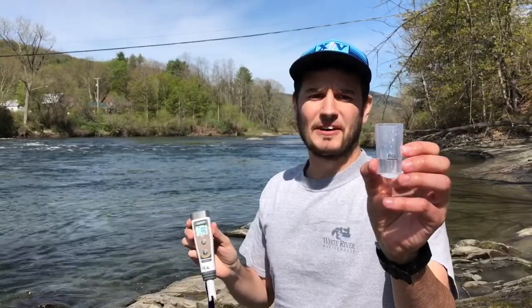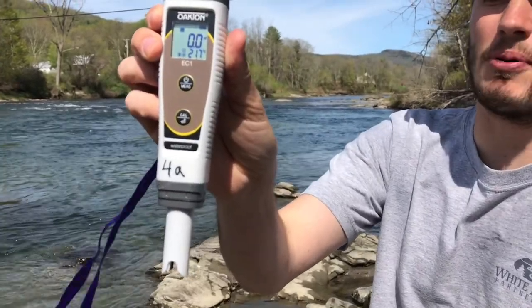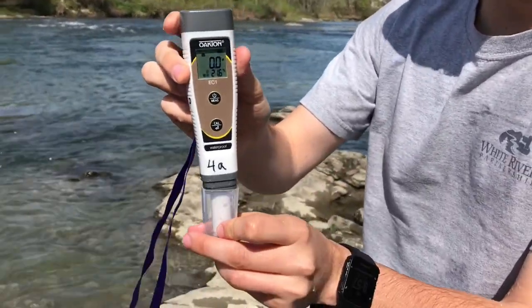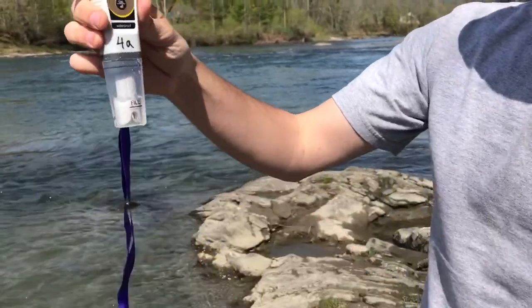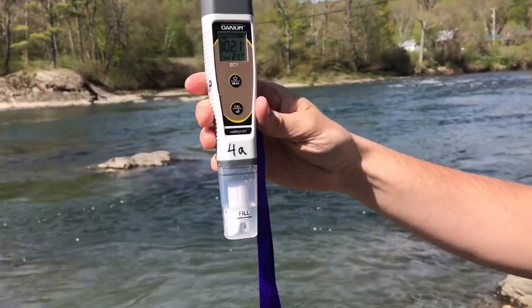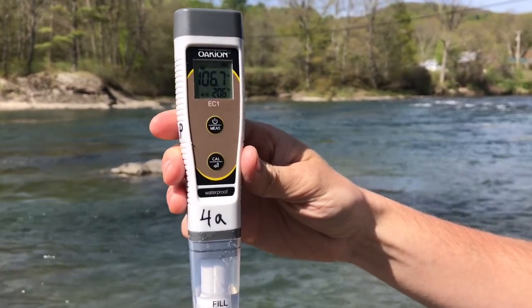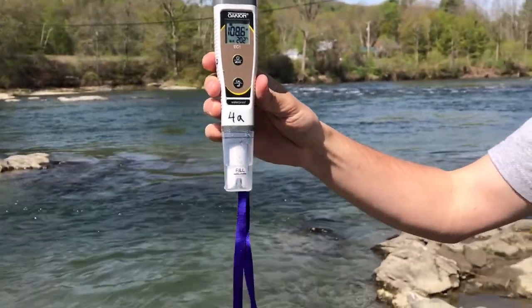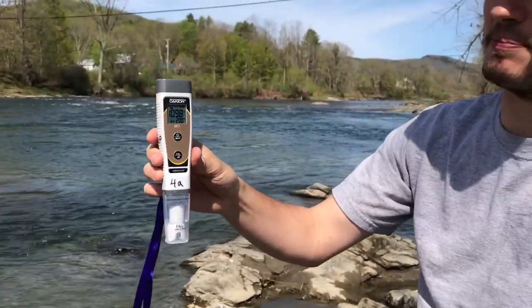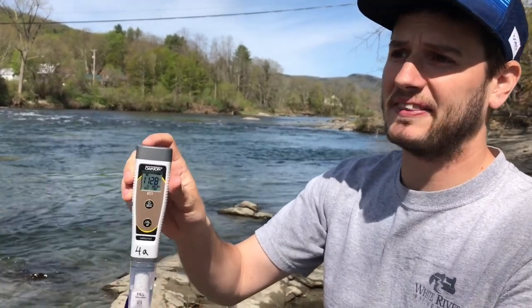Now that I have the cap filled to the fill line and I'm back on shore, I'm going to make sure that my tester is all set with the 0.0 microsiemens reading. I'm going to place it inside the cap and let it sit and slowly get its reading. This pen especially can take a while to get the correct reading, so sometimes what I like to do is get this set and place it in a sturdy position so it won't fall down, and let it stabilize while I go do my E. coli testing and turbidity testing.